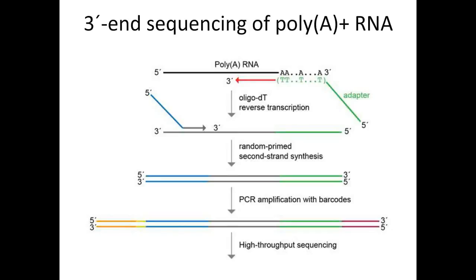So if we look at how 3' end RNA sequencing is accomplished, it's a fairly simple protocol, and another advantage over the whole transcript sequencing is that the library preparation is quite efficient, quite simple. The first step involves the Oligo-dT binding to the poly-A tail that is present on messenger RNAs. And this allows the reverse transcriptase to generate a single-stranded DNA from the RNA. And from there, the library preparation is conducted with random priming of second-strand synthesis and then PCR amplification with barcodes that allow for multiplex high-throughput sequencing.